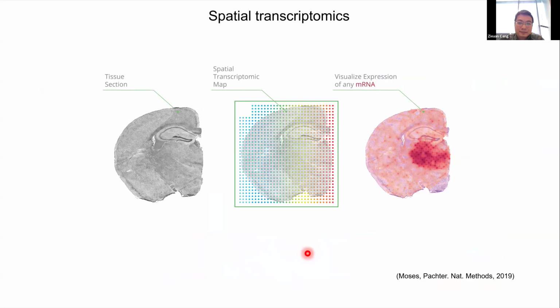Okay, and of course there are two pre-processing steps, I would say, that we want to handle before we really apply some cellular communication analysis. First one is, for example, you're familiar with CellChat, right?